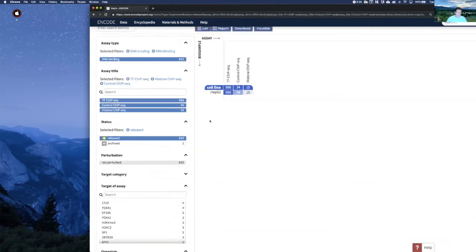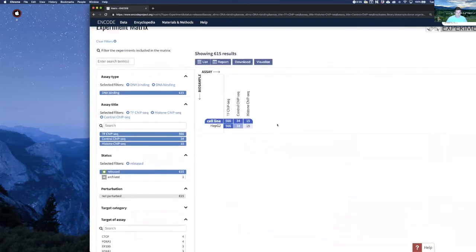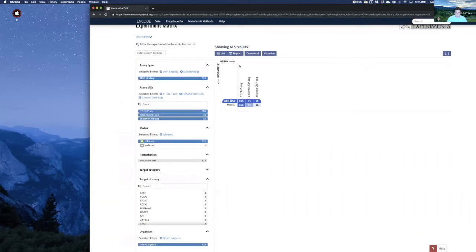And we'll get into these other details, but this is just a way that you can now browse this data really quick, pick the things of interest, the cell type of interest. And now we can click on, I need to zoom out to see, there's 2 things you want to look at here, is the report.